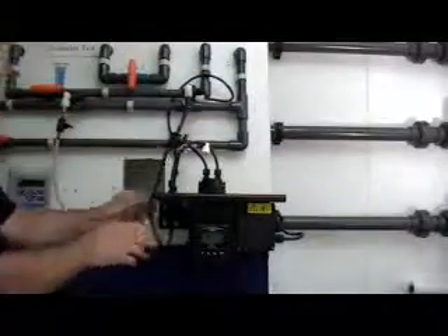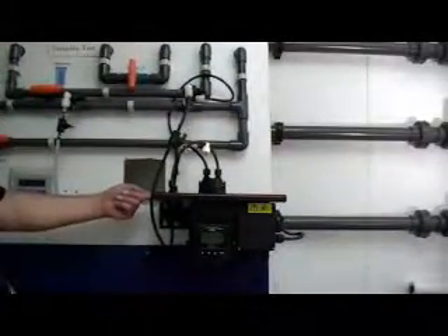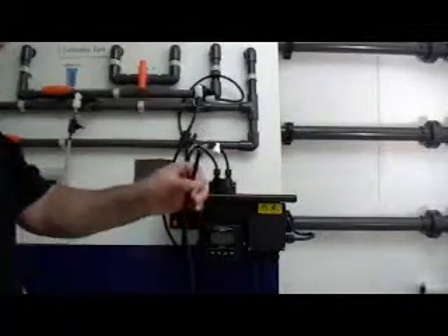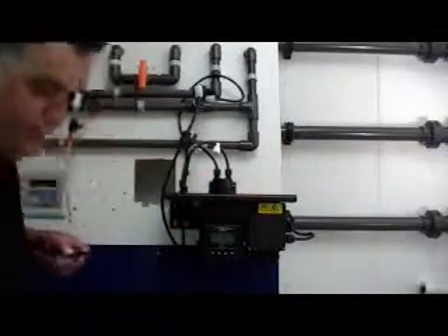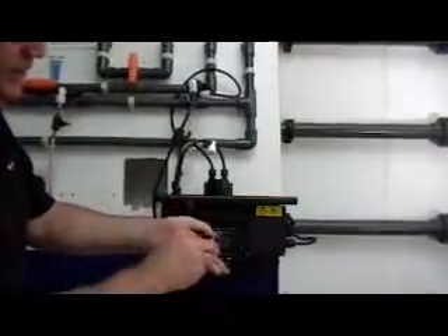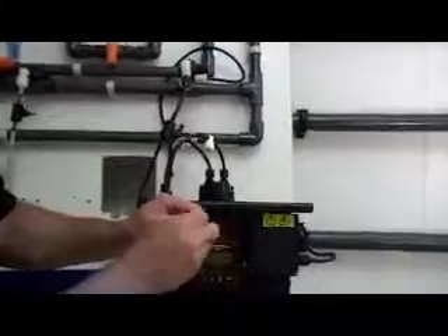Very simply done. We now have the influent line connected to the pressure regulator. The discharge from the turbidimeter usually goes straight to drain and is not recirculated back into the system. Using another 4.75 millimeter tube, I will first install my threaded connector onto the tube and then insert a ferrule into the ID of the tube. The tube will then be connected to the nipple assembly marked out.